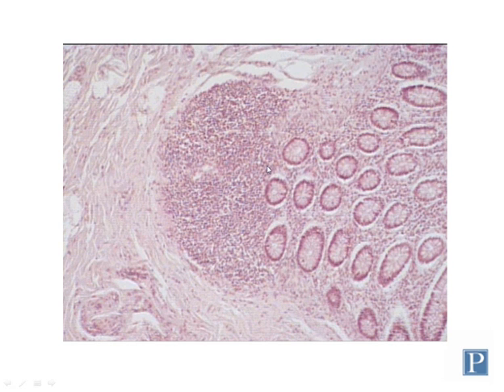There are both B lymphocytes and T lymphocytes associated with solitary lymphoid nodules. And B lymphocytes and T lymphocytes, as you may recall, are indistinguishable histologically using a simple stain like an H&E stain, which is used for this slide. So the way that you can tell them apart is based on their distribution within the tissues, such that B lymphocytes are organized together in these nodular clusters. So this nodule here is composed of B lymphocytes.